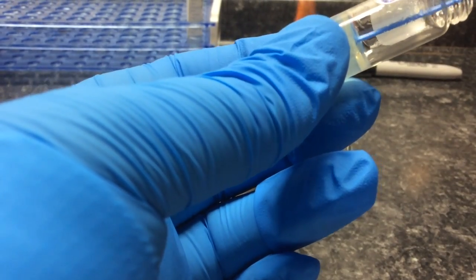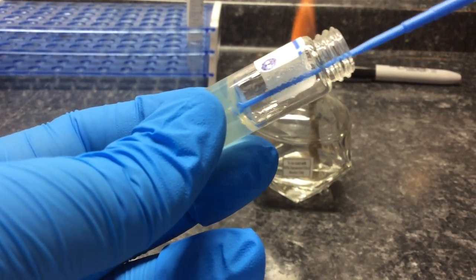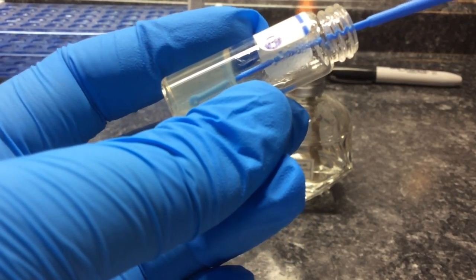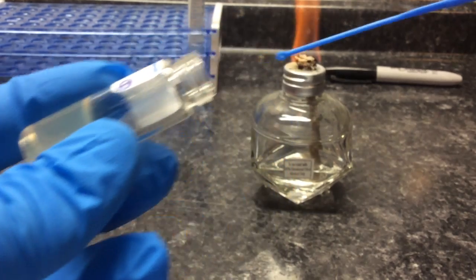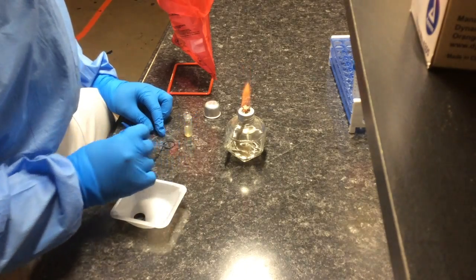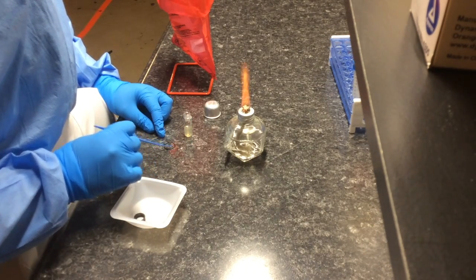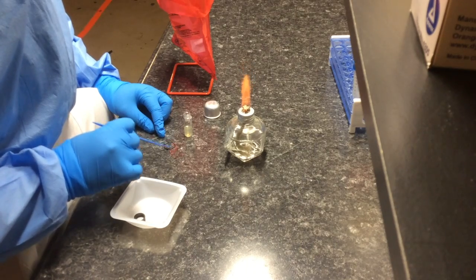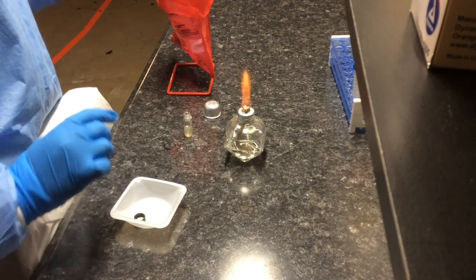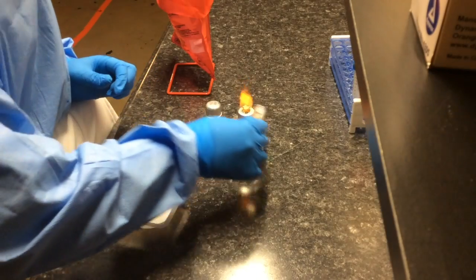Take some of the bacteria out, flame the vial, then rub your slide through the water on the slide. Once that's done, place the used loop in a biohazard container and flame your tube.